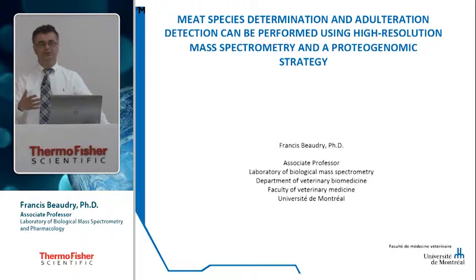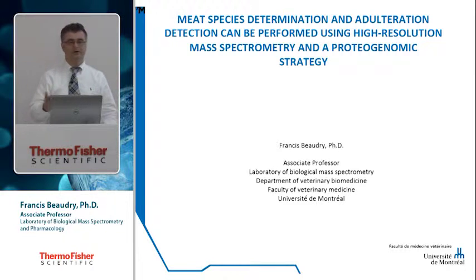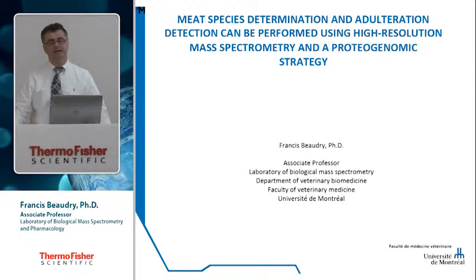So from that proteomic knowledge that we have developed, and specifically targeted proteomics, I've been involved with Thermo a couple of years now down the road, and they liked the strategy we developed, so they wanted us to maybe apply that strategy to this problem of meat authenticity.